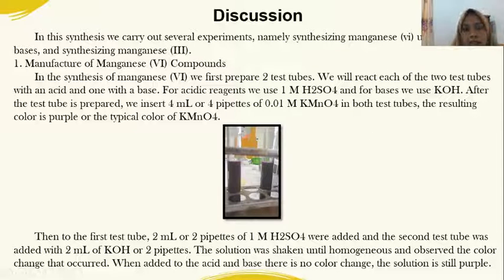First, synthesis of Mn(VI) compounds. In this synthesis of Mn(VI), we first prepare two test tubes. We will react each of the two test tubes, one with an acid and one with a base. For acidic reagent, we use 1 molar H2SO4, and for base, we use KOH.